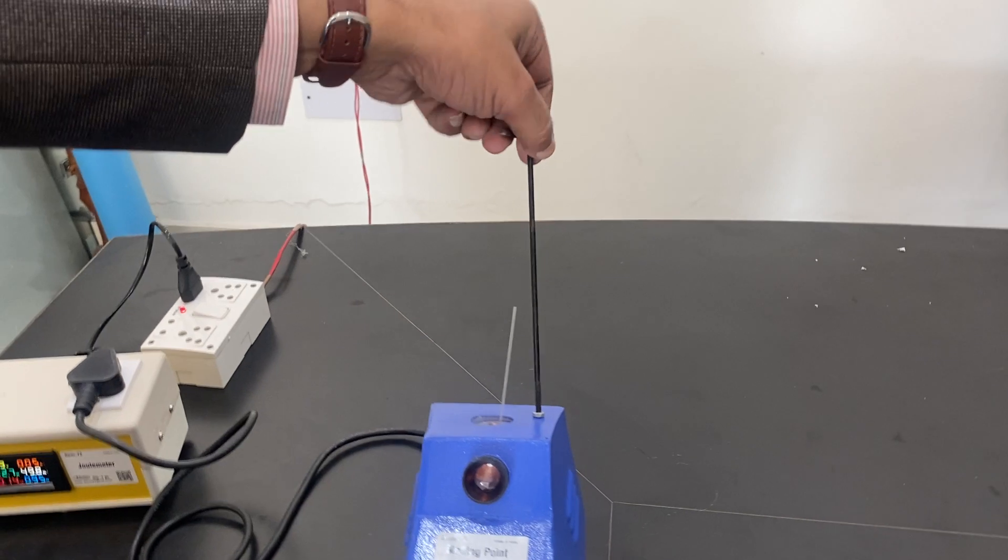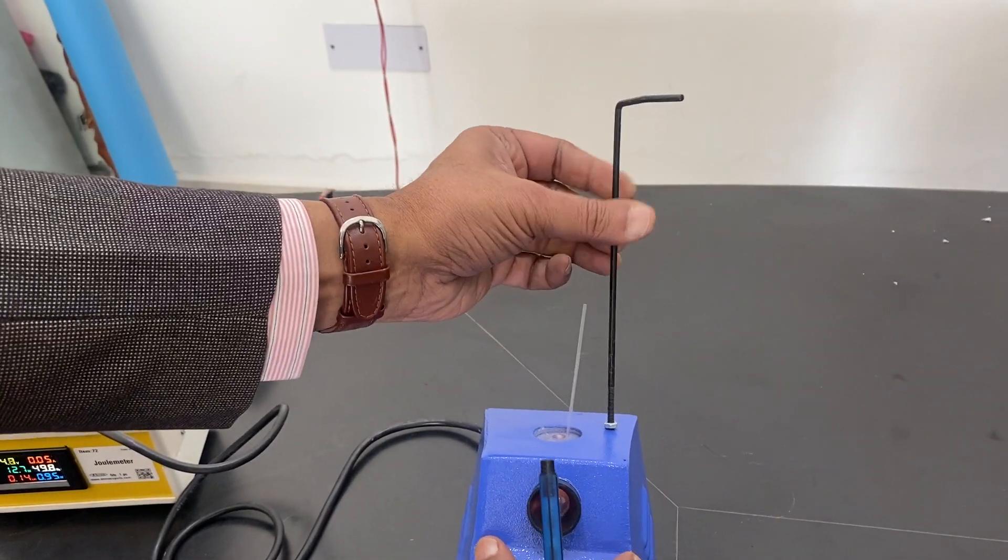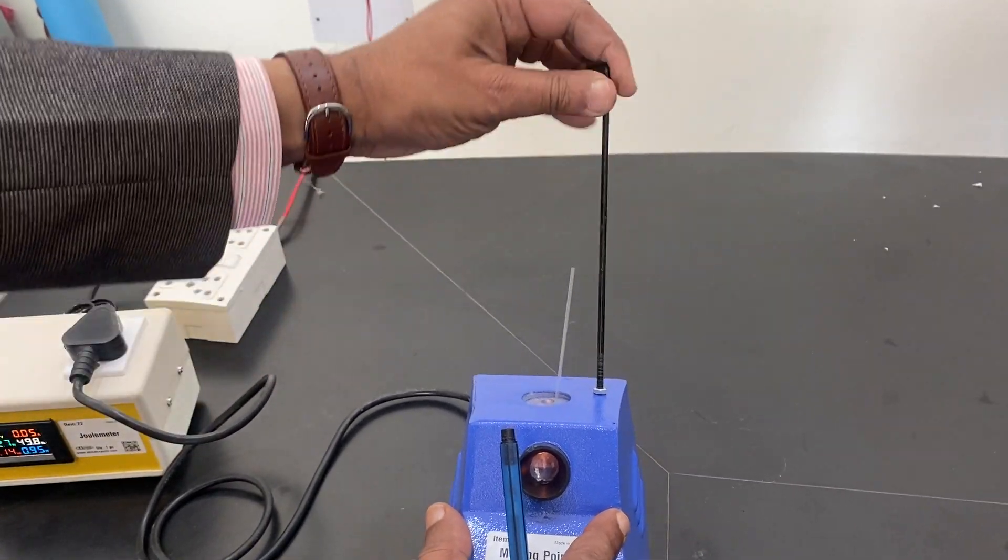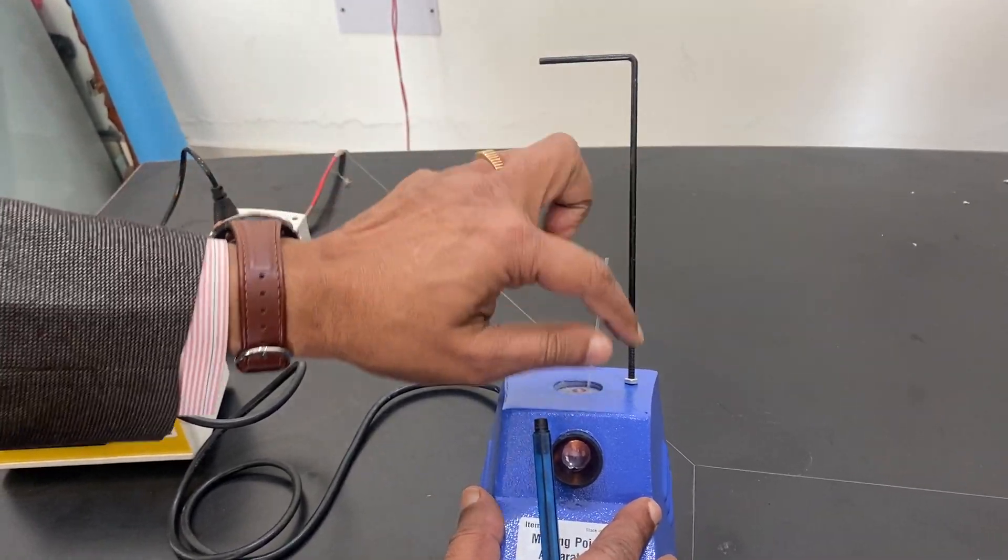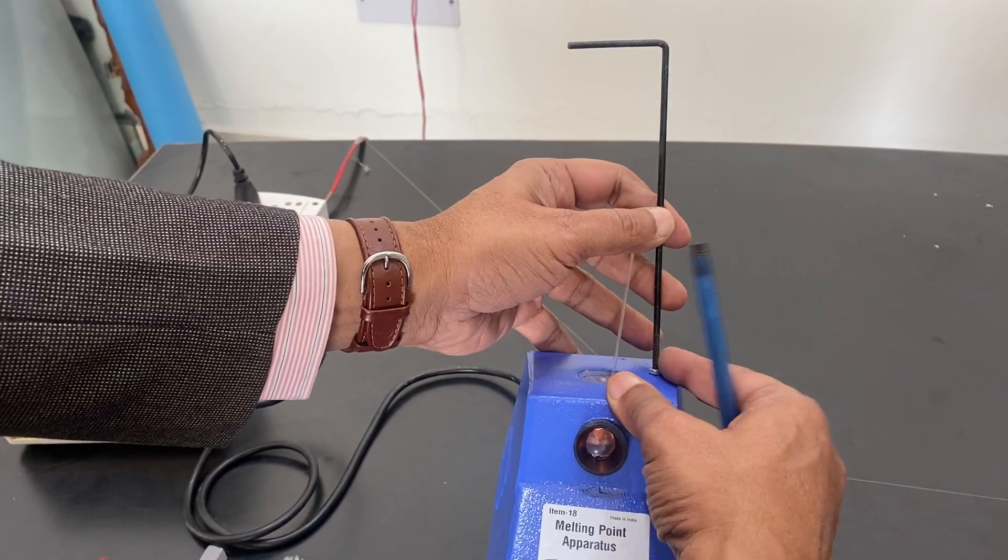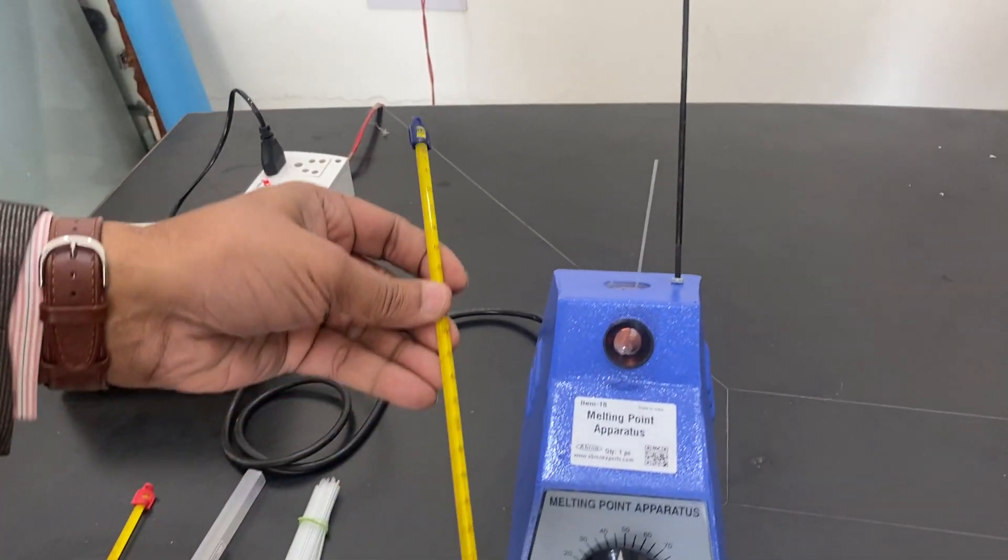Very easy to use. First of all, you have to fit this part and see that when you hold it, this is in the front side. There is a screw to tighten it so that it does not move. This is a thermometer.